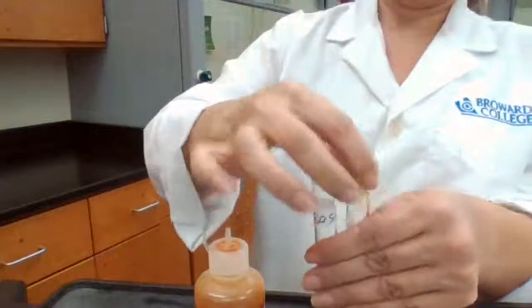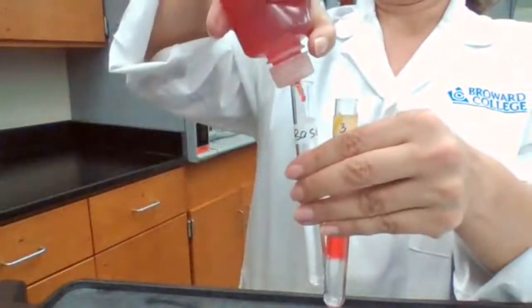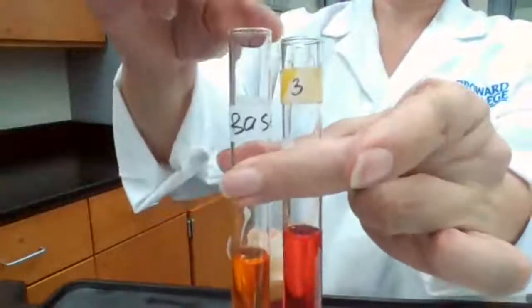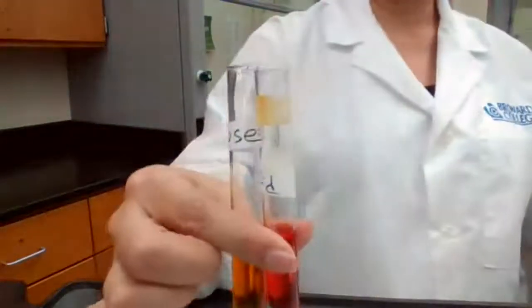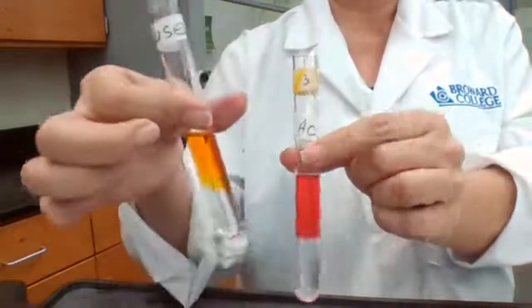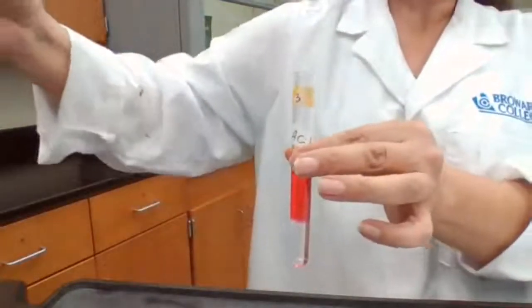And in base, the color is yellow. Record your observation. If you have your data sheet open, you can record it: in the acid, red color, and yellow color in base.